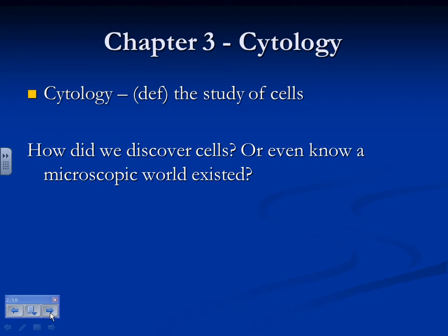All right. So today I really want to focus on two things. And this is what you guys just read a little bit about. Each group focused on a little different aspect. The first group was focusing more on the history. The second group was talking more about size, measuring. How do we measure in a small realm? Third group was focused on what an electron microscope is, how it's different. And then this fourth group was actually looking at different kinds of electron microscopes. So there's a couple different aspects we'll hit today, and some aspects we'll probably hit a little bit more next time.